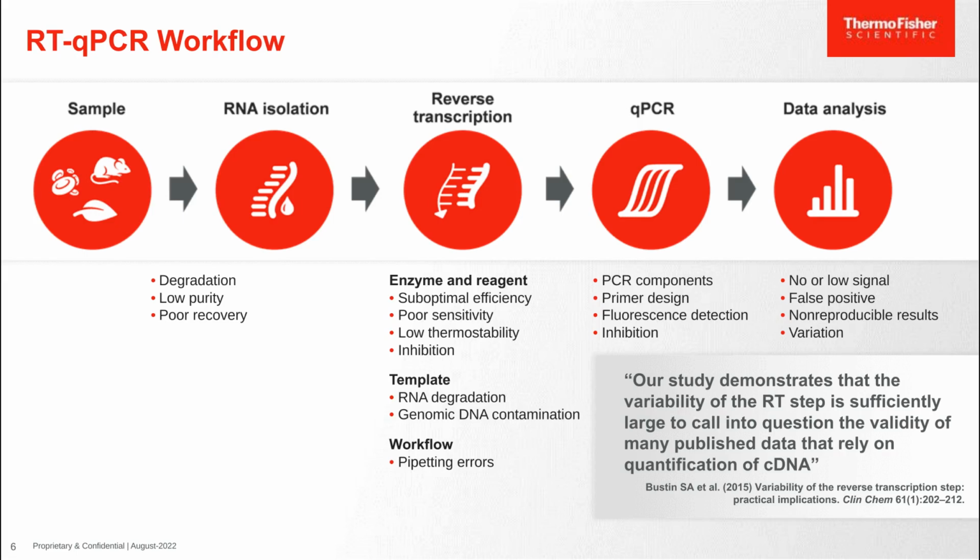By design, the RT-qPCR technique is very sensitive, which is useful when attempting to detect very small differences in these levels, so that very small variants in gene expression can be detected. This enhanced sensitivity, however, also means that small variants introduced during the RT-qPCR setup or during the workflow can have an effect on the RT-qPCR results, which can therefore result in variants and inaccurate gene expression data.